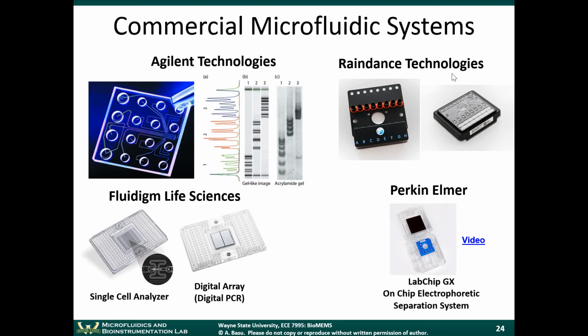It uses droplets because the DNA has to be encapsulated into really small chambers where, on average, statistically, there's one or fewer DNA molecules per droplet. They do PCR on each of these droplets and look at which droplets fluoresce. The number of droplets that fluoresce tells you the number of DNA molecules in the solution. It's a very accurate, very precise way of doing DNA counting, and it's becoming very popular right now.